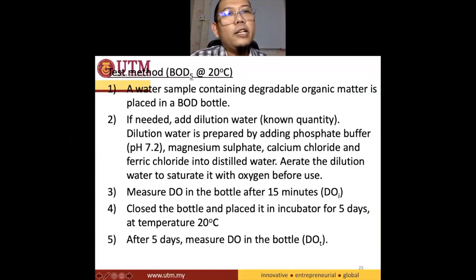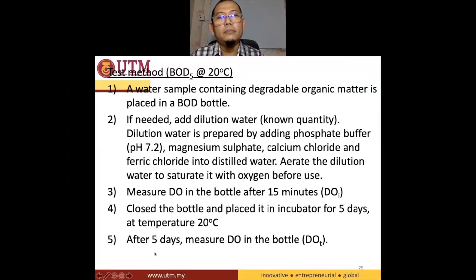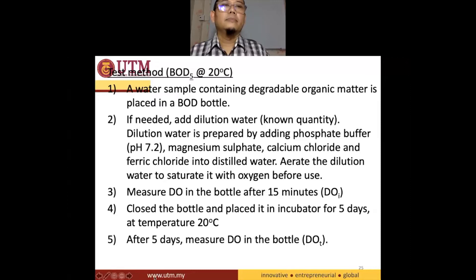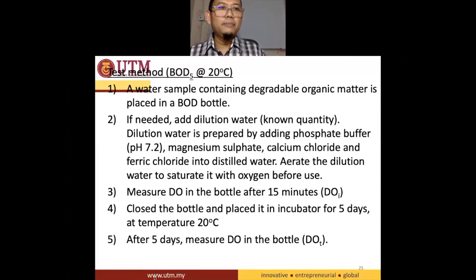I'll give a moment for you guys to read the method. Imagining that we are taking samples from the river — this is the sample of water from a certain river, let's say River UPM. We bring it to the lab, and all this sample needs to be poured inside the BOD bottle.